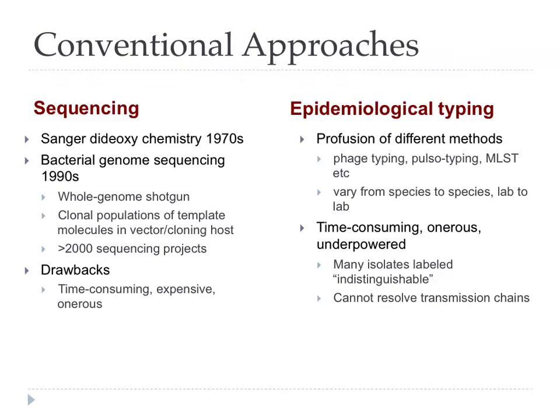So if we look at what used to be the case, what is still the case in some areas, we have sequencing invented in the 1970s with Sanger dideoxy sequencing primarily, genome sequencing coming in the 1990s. Both approaches rather time-consuming, expensive, low throughput, and really not suitable for the average laboratory, either in a hospital or in a university environment, and certainly at genome level, stuck in institutes.